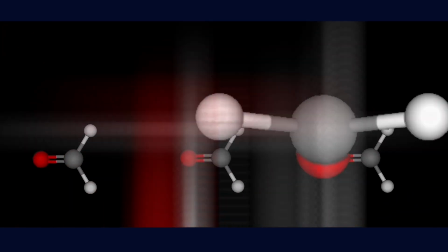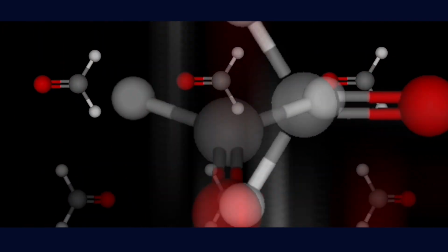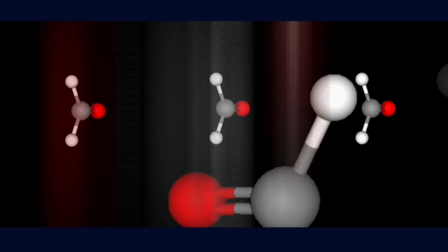Did I mention that formaldehyde forms during this reaction? For every 4 methylamines, 6 formaldehydes form. That is why I performed this outside. The reaction in more detail. First, the nitrogens are protonated by the acid.